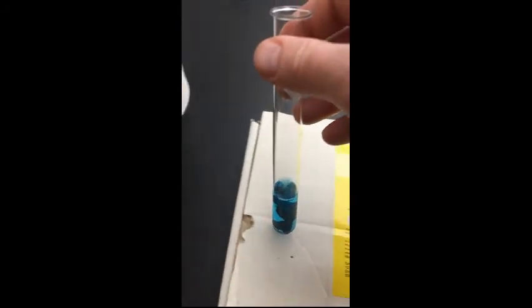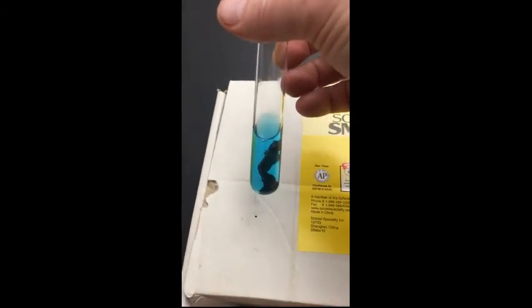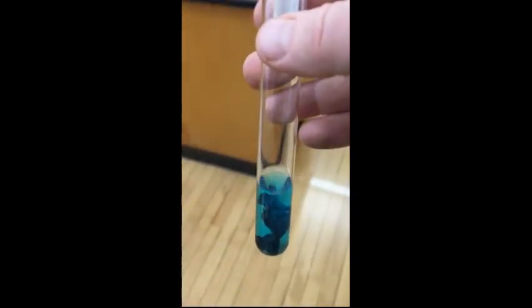Okay, I forgot to show you the final product here of the zinc in the copper sulfate. So the zinc was a nice shiny color. I'm going to bring it back here and pour it in the sink, and that'll give you a better idea as to what color it turned.